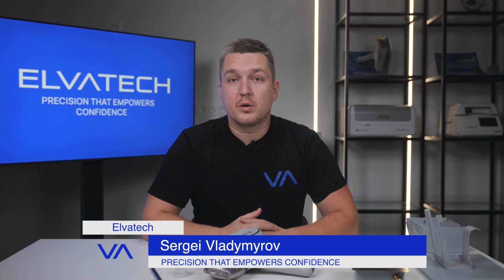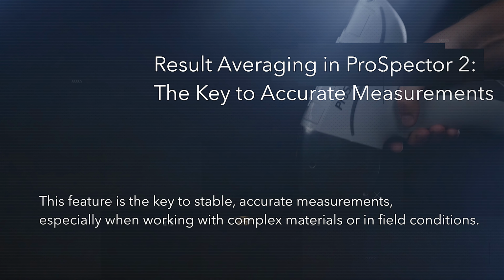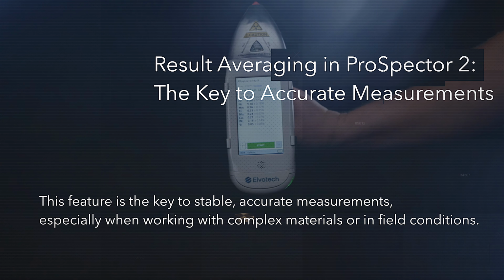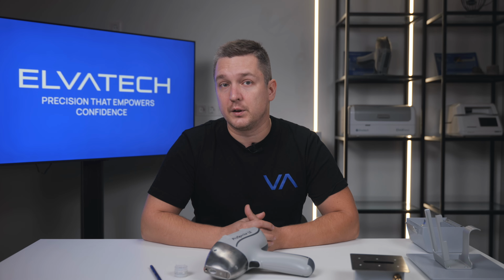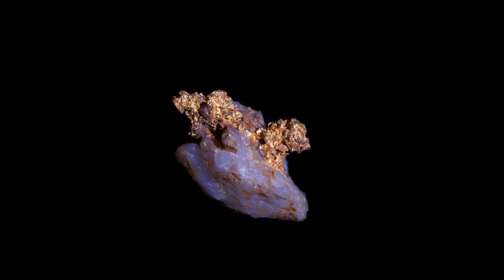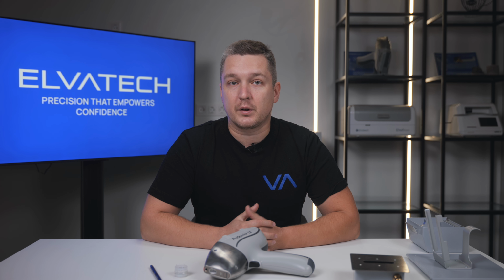My name is Sergey, and today we will break down one of the most important features in ProSpector 2, results averaging mode. This feature is the key to stable, accurate measurements, especially when working with complex materials or in field conditions. Due to the heterogeneity of some samples, a single analysis may not provide the full picture of the chemical composition. In such cases, the result averaging feature comes in handy.